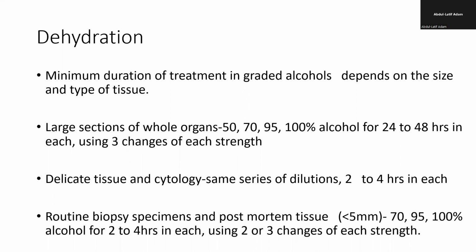You can dehydrate for between 24 hours and 48 hours for very dense tissues that are thick with cells. But if you have very delicate tissues, like true-cut biopsies and bone marrows, you can dehydrate over just a few hours and then it will be done.